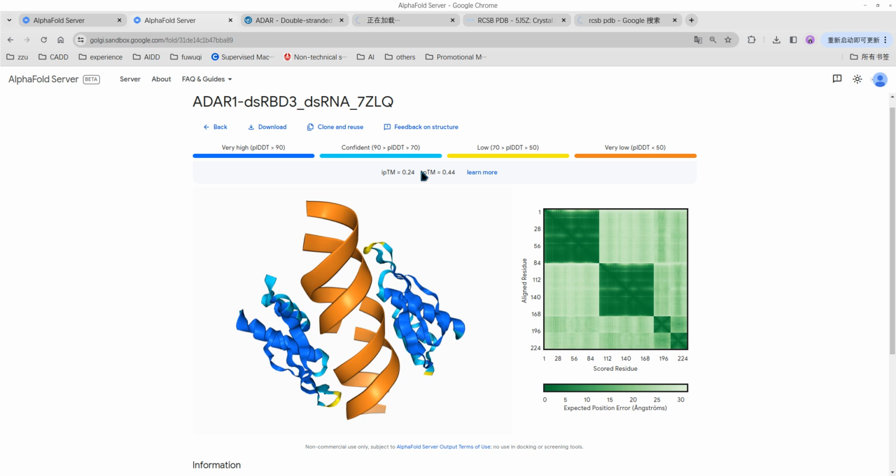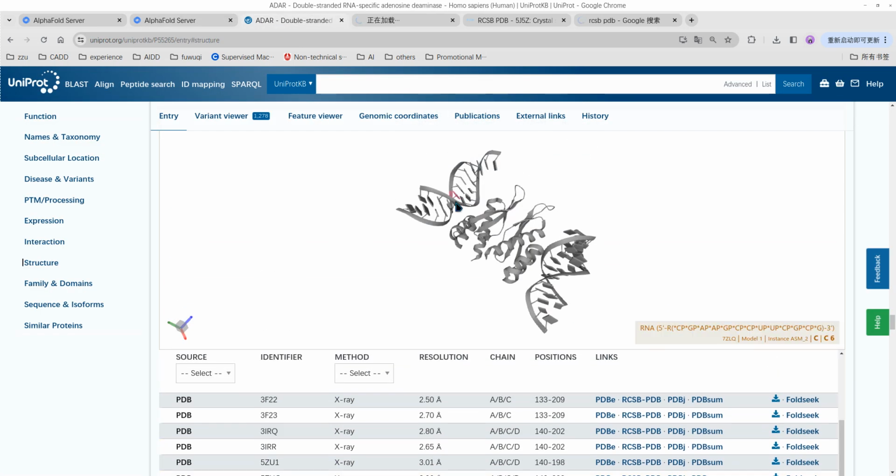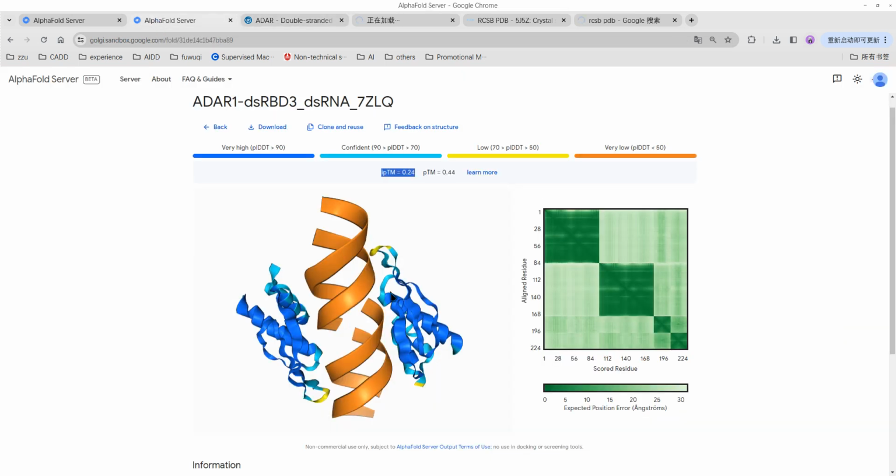We open the PyMol software and drag the two proteins in, and we can see the protein has been dragged in advance in this video. We display the crystal structure as a white cartoon and model_0 in green. Select the align function in the action and compare.